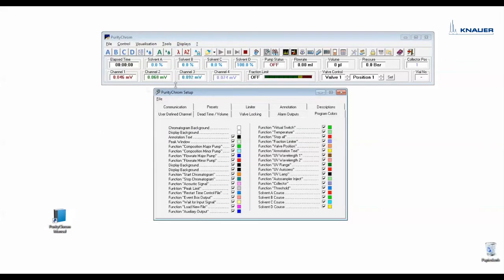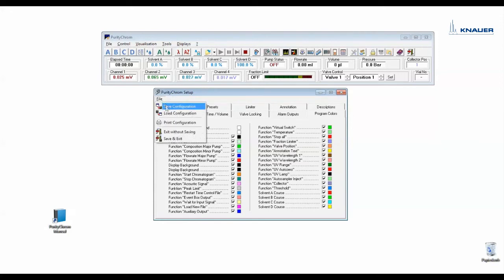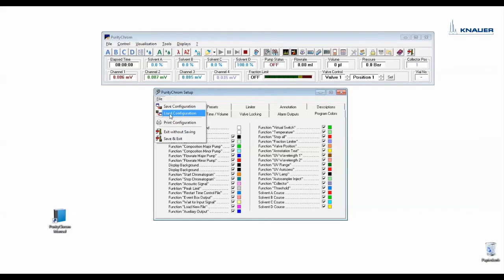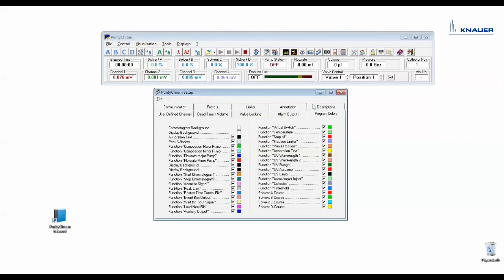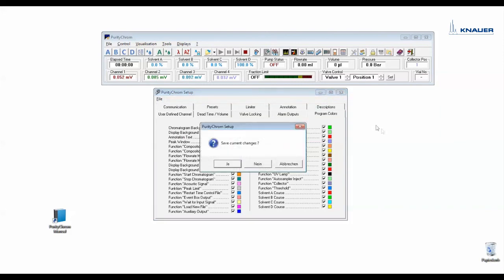If you want to save your setup you can do it in file and save configuration. If you want to load another configuration you can go here, click load configuration and search for your wanted configuration. Closing the setup you will be asked if you want to save the configuration.